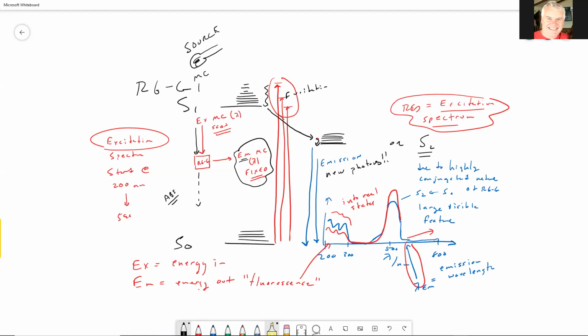And then one wavelength comes out, and that one wavelength interacts with the sample. And then relative to a blank, you can calculate how much of that light is absorbed by the molecules. Does that make sense?